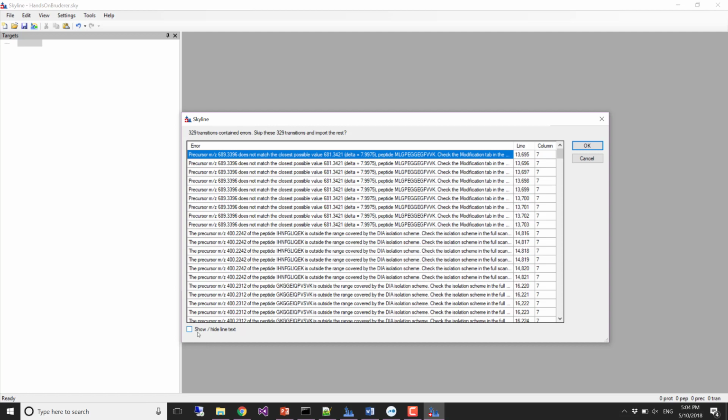There must be some setting. Has anybody gotten to here, 329? Okay, wow. And has anybody not gotten 329? Oh, wow, quite a few people. Okay, so what did you get? 20,000. Yeah, so there's a lot of rows in here, and every row can potentially cause an error.